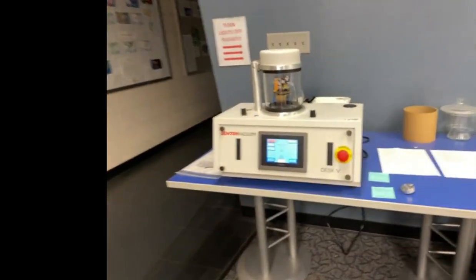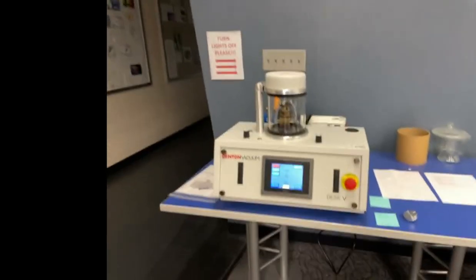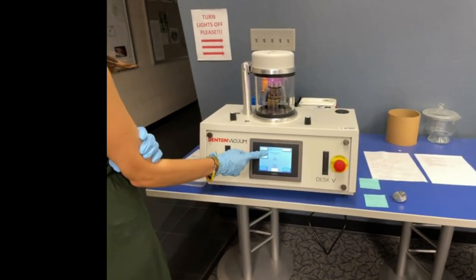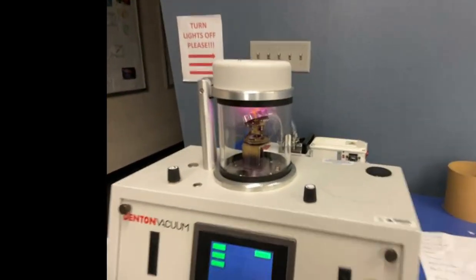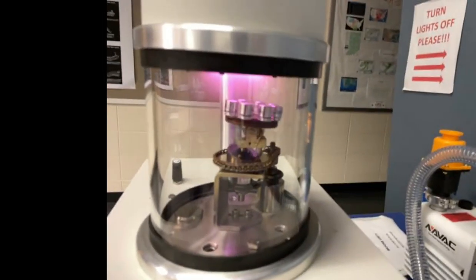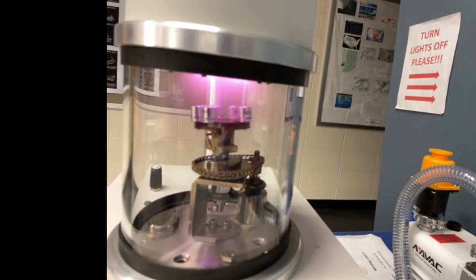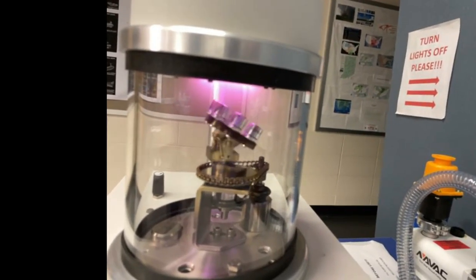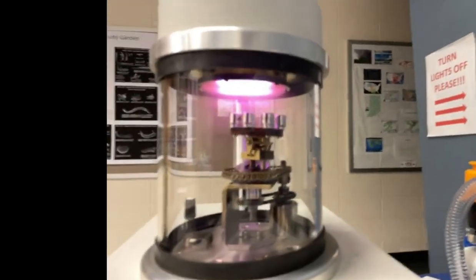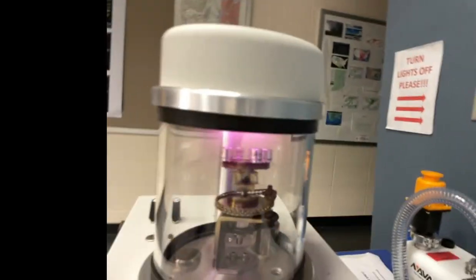It went up. It's close enough. Let's do it. Okay, so we're going to turn on the sputter coater. What that does is it creates this plasma cloud, which is sputter coating over the samples that we put in there. You can see they're spinning around in a disco fashion. You can actually see the plasma cloud is that purple thing up there.